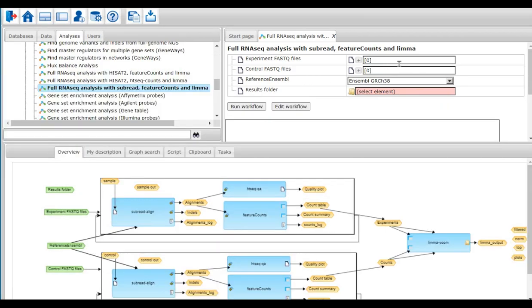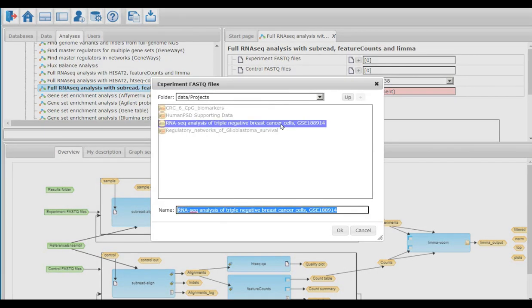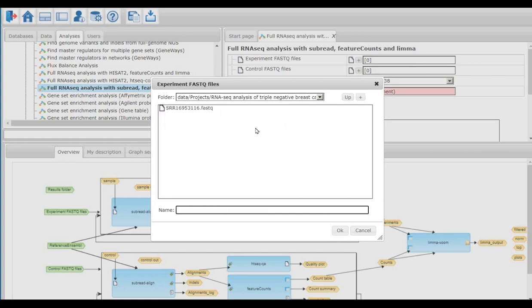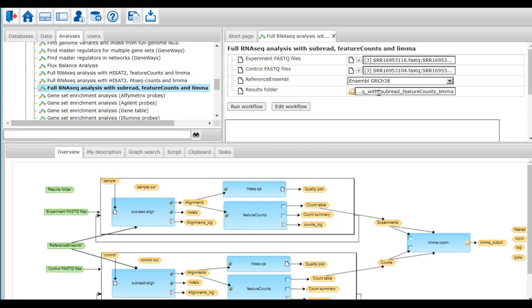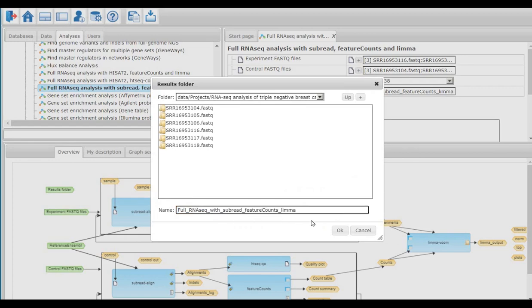Now I input the MDA231 and MCF7 files into my workflow. Here I have to be careful and input FASTAQ files belonging to one condition in one category. Being careful at this step is crucial for my results. Ensemble GRCh38 is used as the reference ensemble. The path and name of the output folder can be defined in the section results folder. Here I name my output folder as full RNA-seq with subread feature counts and limma.